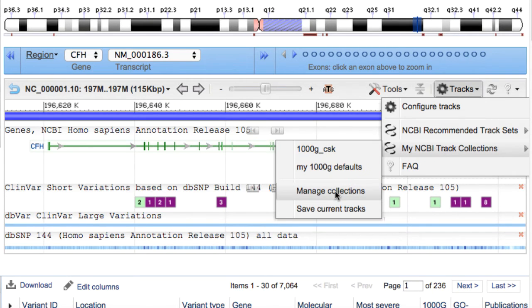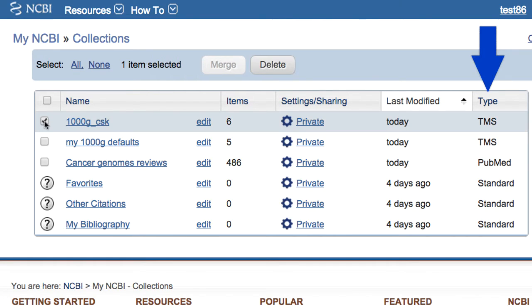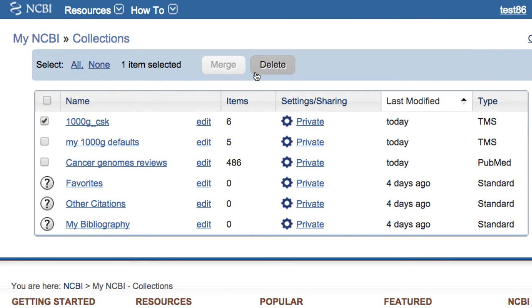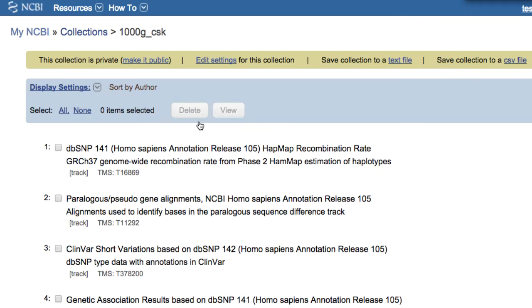To edit the content of a collection, click the Manage Collections menu option, which takes you into the My NCBI interface. Here, track collections are type TMS for Track Management System. You can delete an entire collection by selecting it and clicking Delete. To modify the content of a collection, click the Edit link. You can then select individual tracks to delete from the collection, or perform other editing operations.